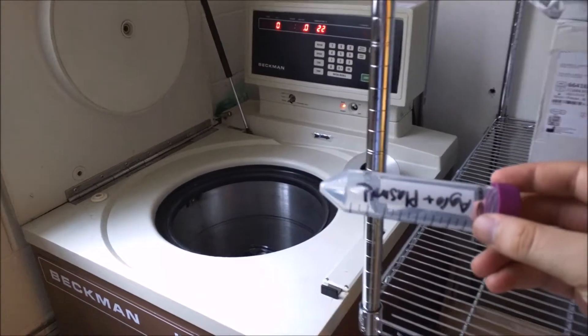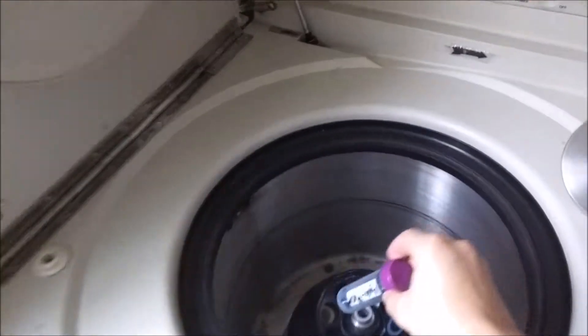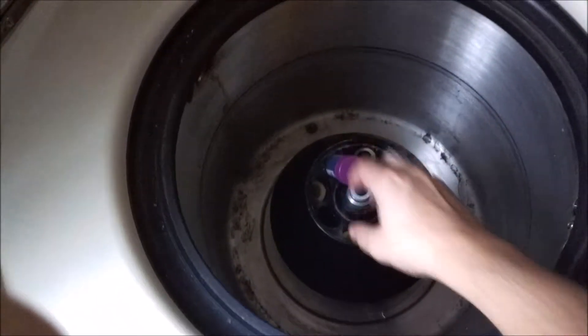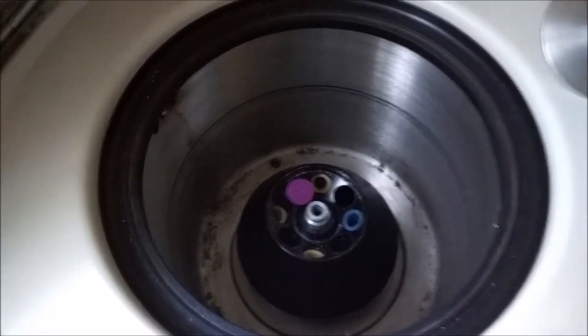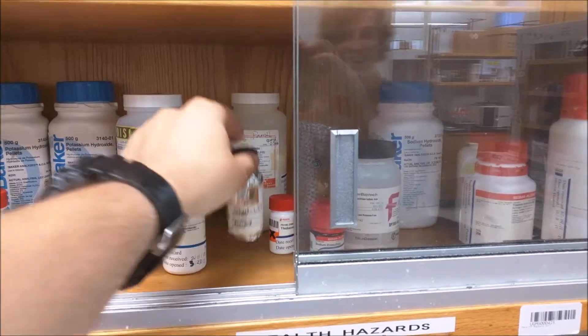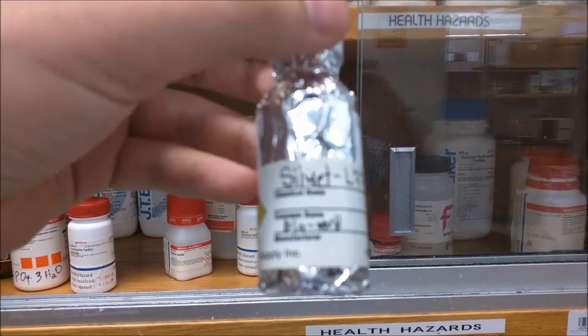We don't want the culture media on our plants, so we pellet the Agro cells in this centrifuge. The cells are resuspended in a solution of sugars and Silwet L-77, a surfactant.